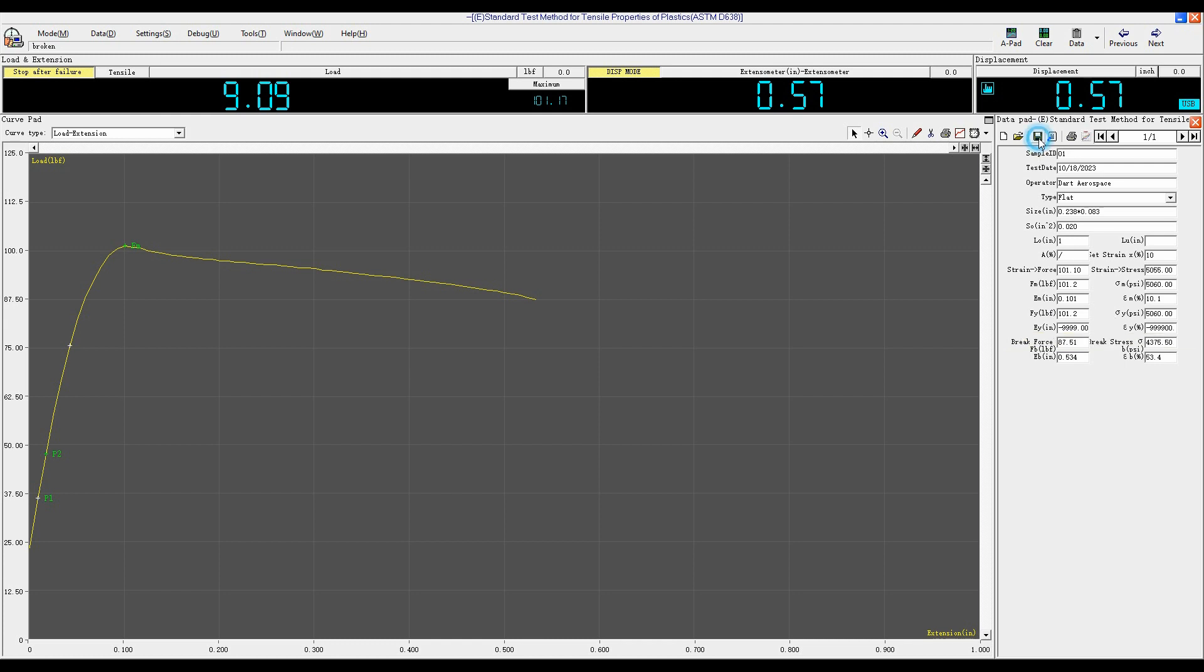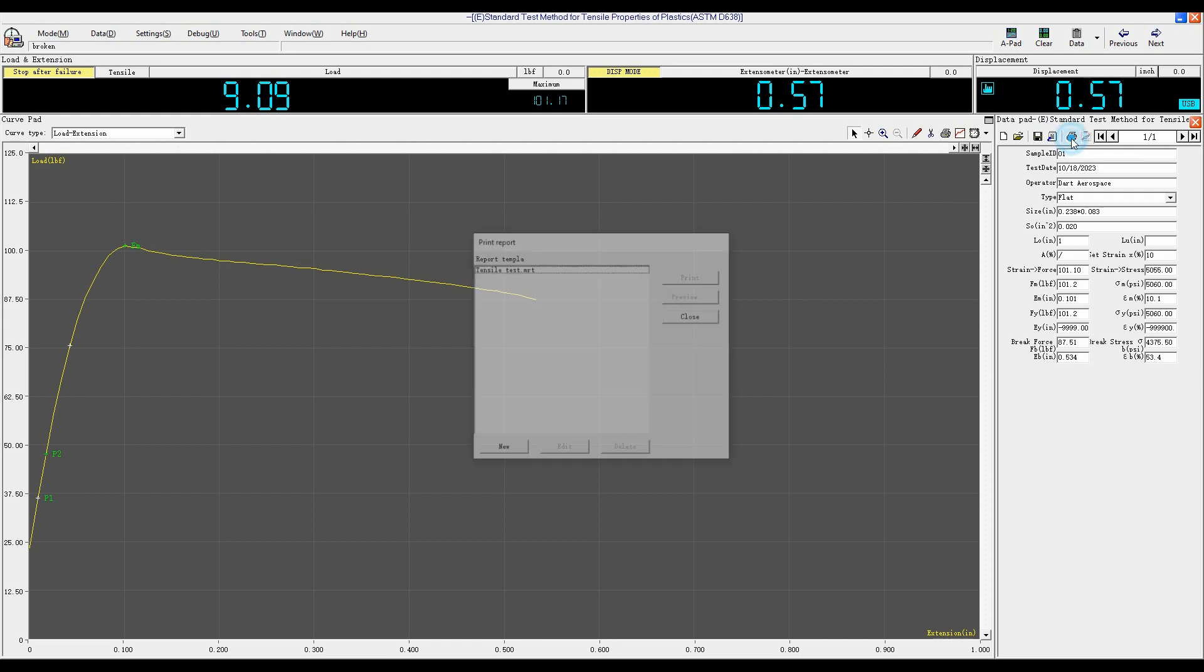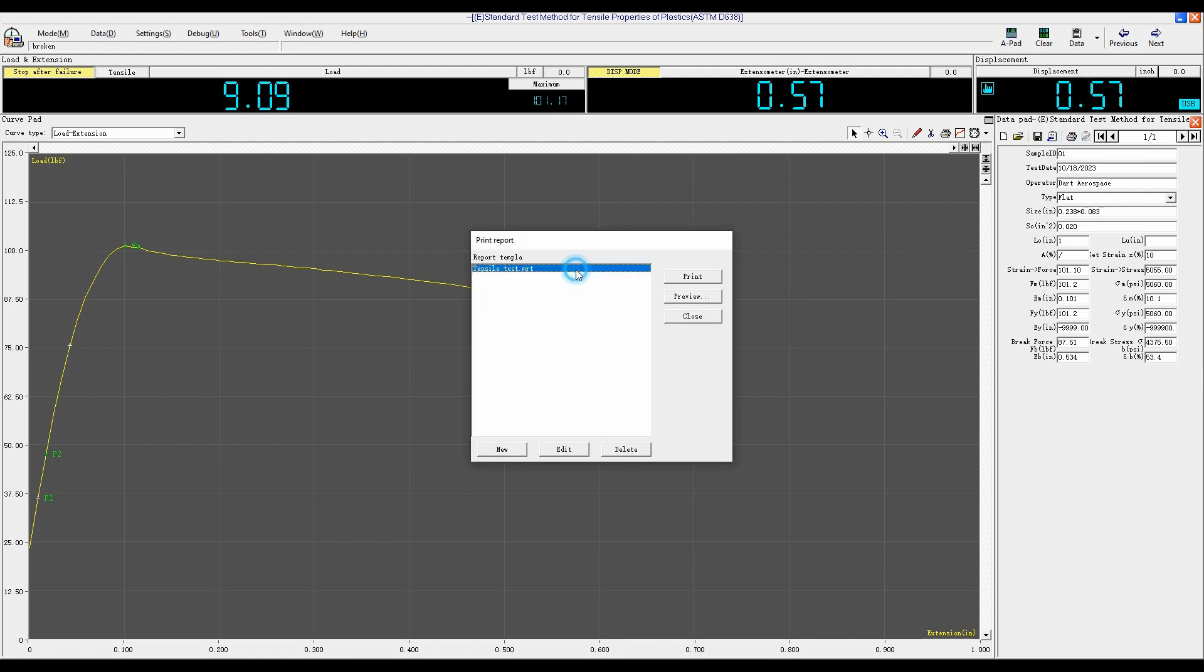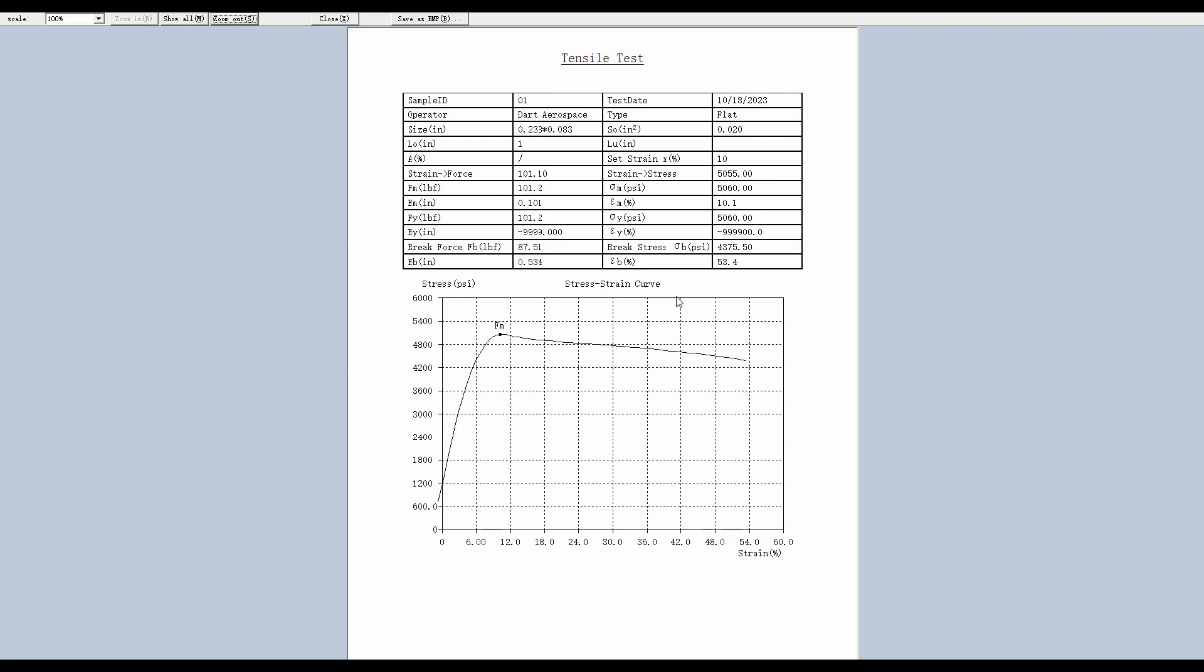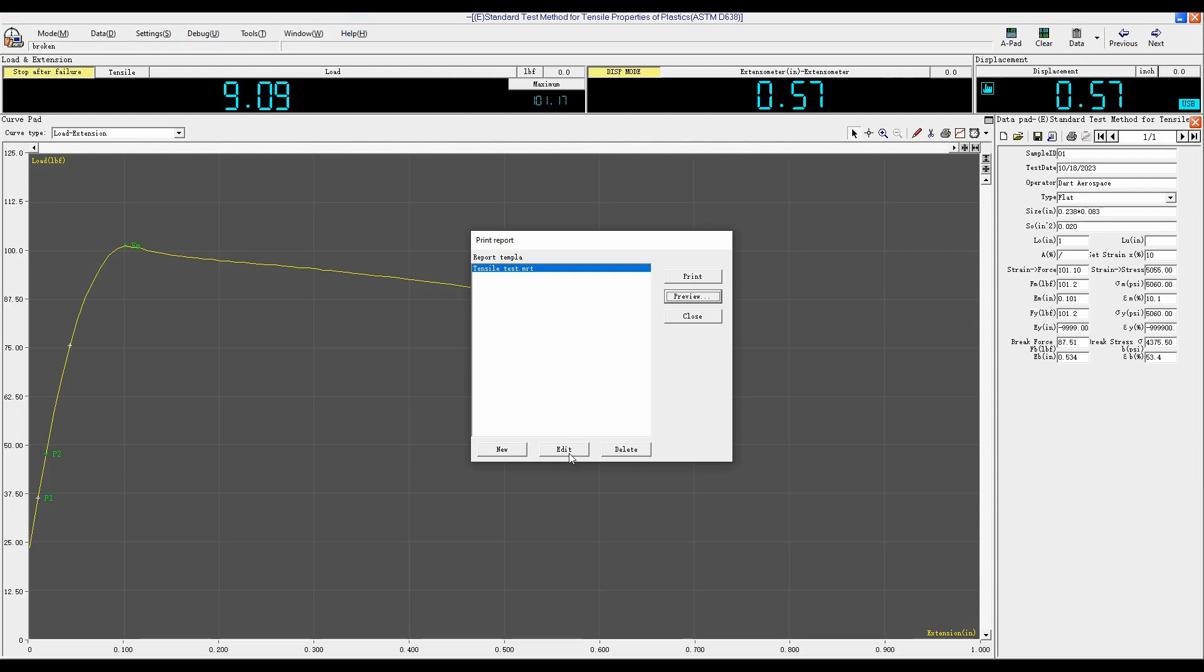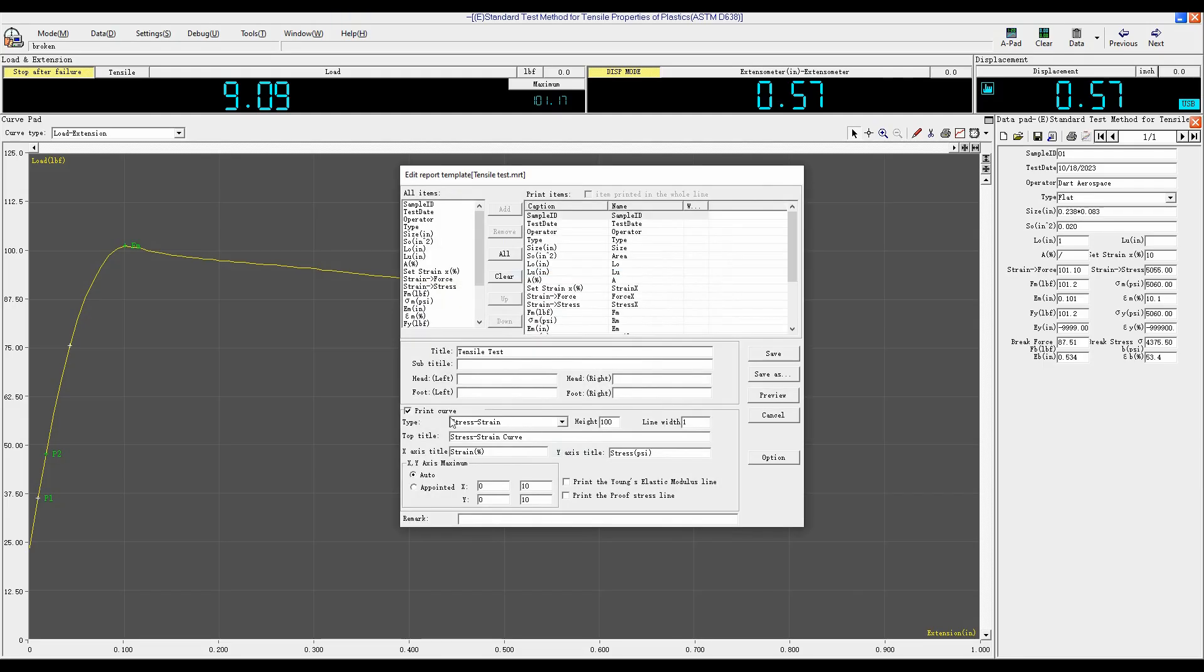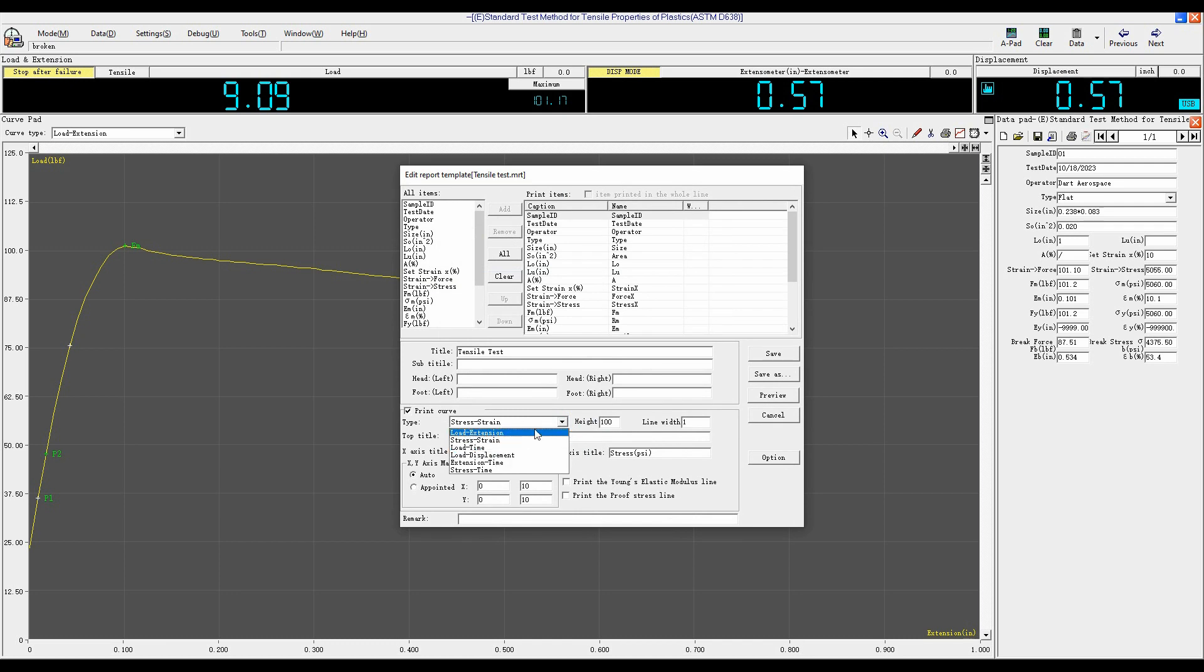Click Save, and then click Print to print the test report, click Preview. You can click Edit to choose Print stress strain or load time, load extension curve.